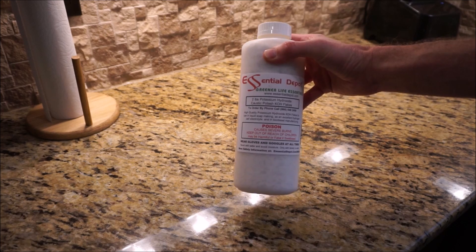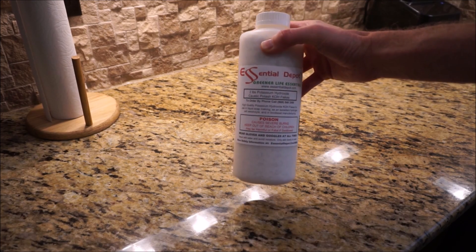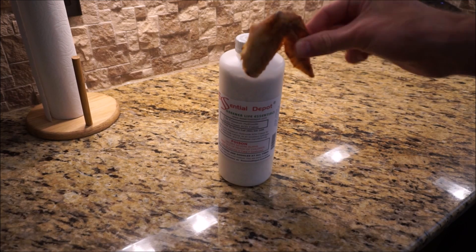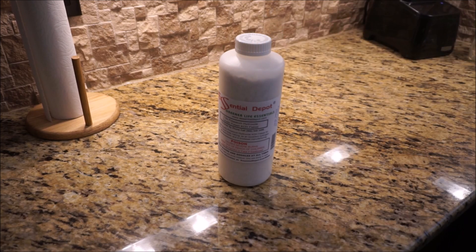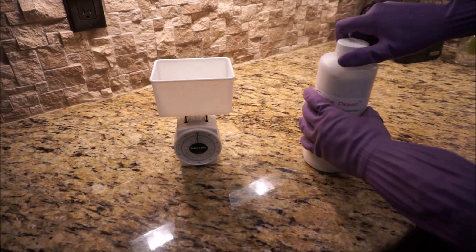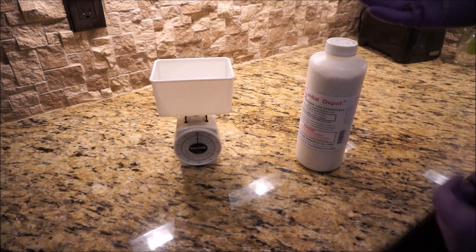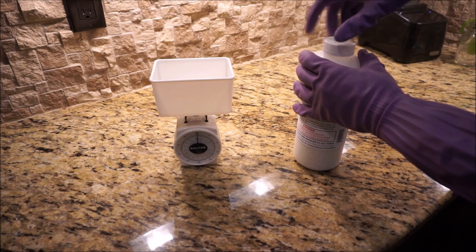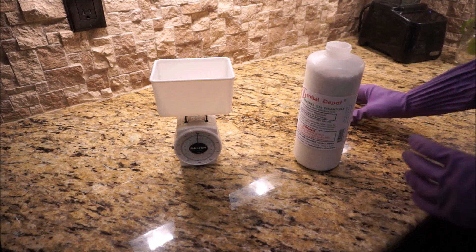Today I'm going to be using a very caustic solution of potassium hydroxide to dissolve chicken flesh. I'm using gloves — you don't want to let any of this get on your skin. It will cause severe burns.